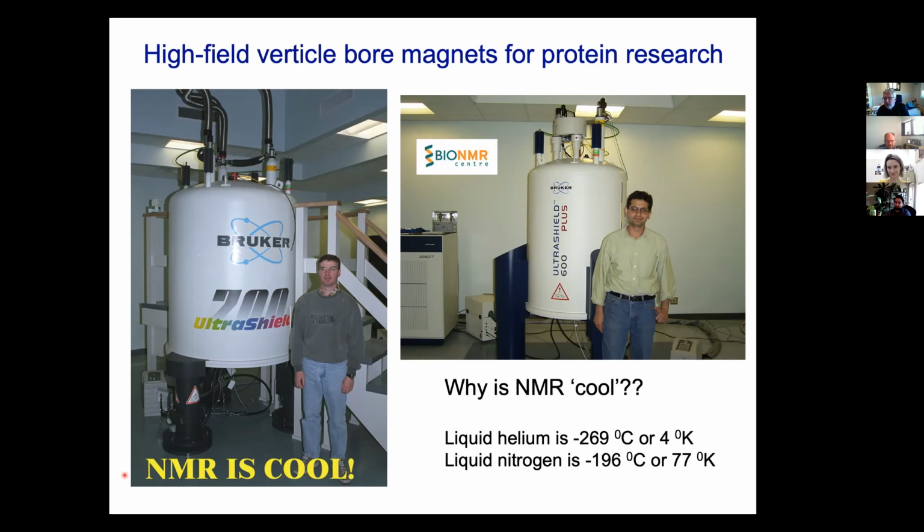It's only minus 196 degrees Celsius, and it's 70 degrees warmer than this. Yet the sample that sits in the vertical bore sits at room temperature, 25 degrees. And in many cases, we run experiments at 37 degrees because that's the temperature of the human body, and so that's representative for what would happen in our bodies.